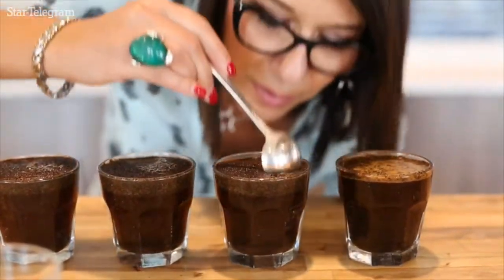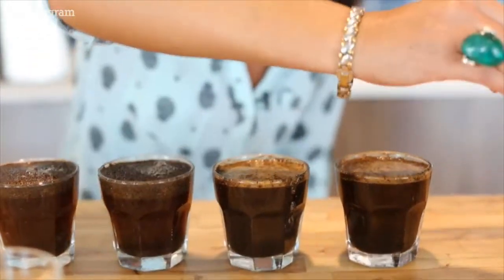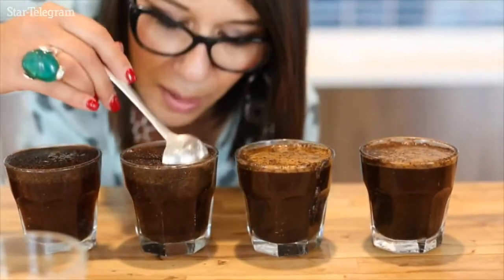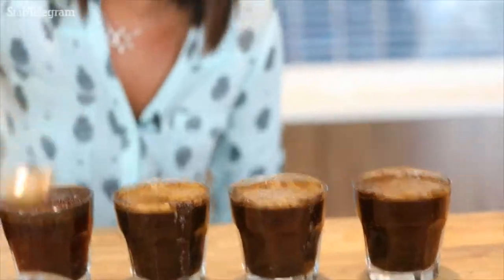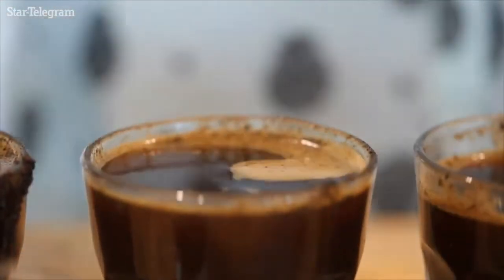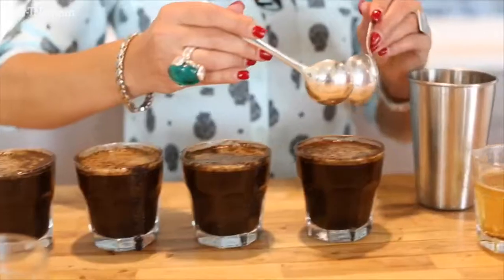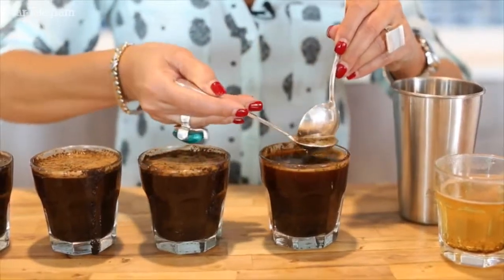We break every single cup and we have to clean the spoon every time that we are going to start a new cup to avoid cross-contamination between the cups. Once we break the cups, we need to clean the cups in order to be able to do the sensory evaluations. We use two spoons to remove the crust of the coffee.